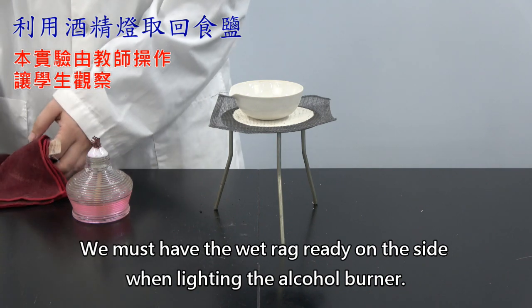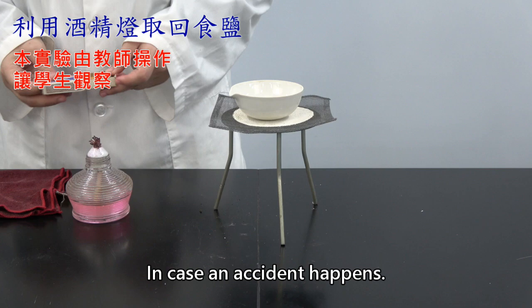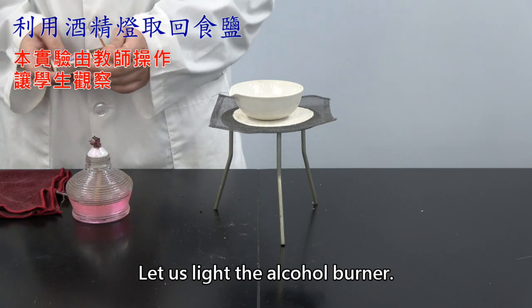We must have the wet rag ready on the side when lighting the alcohol burner, in case an accident happens. Let us light the alcohol burner.